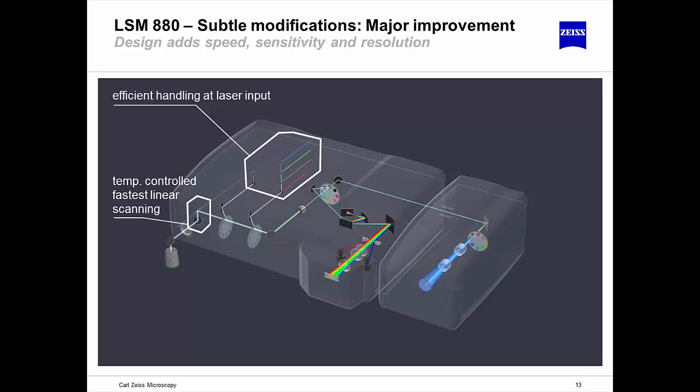By that, I mean that they are water-cooled, and I'll come back to that in a little bit more detail later. The excitation and the emission light go via what we call the twin gate. This is a very low incident angle dichroic system so that you get much greater levels of blocking than you do in previous generations of confocal.